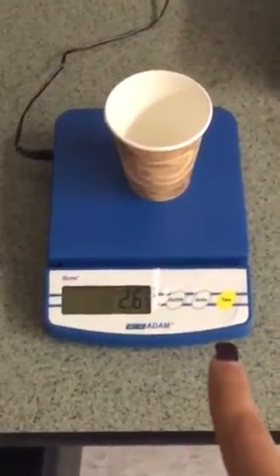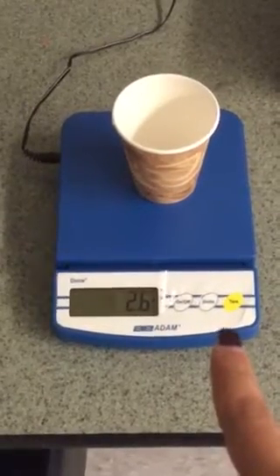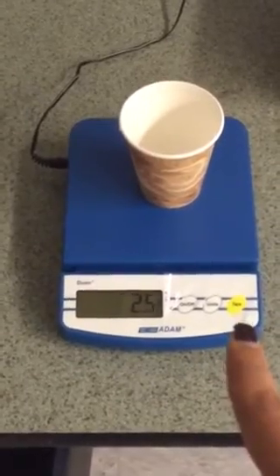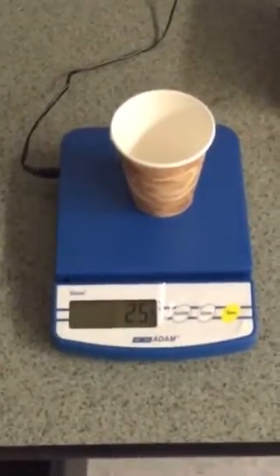What the tare button did was it cleared out, or zeroed, the mass of the cup so we would just get an accurate measurement of the salt. This is Ms. Salari signing off.